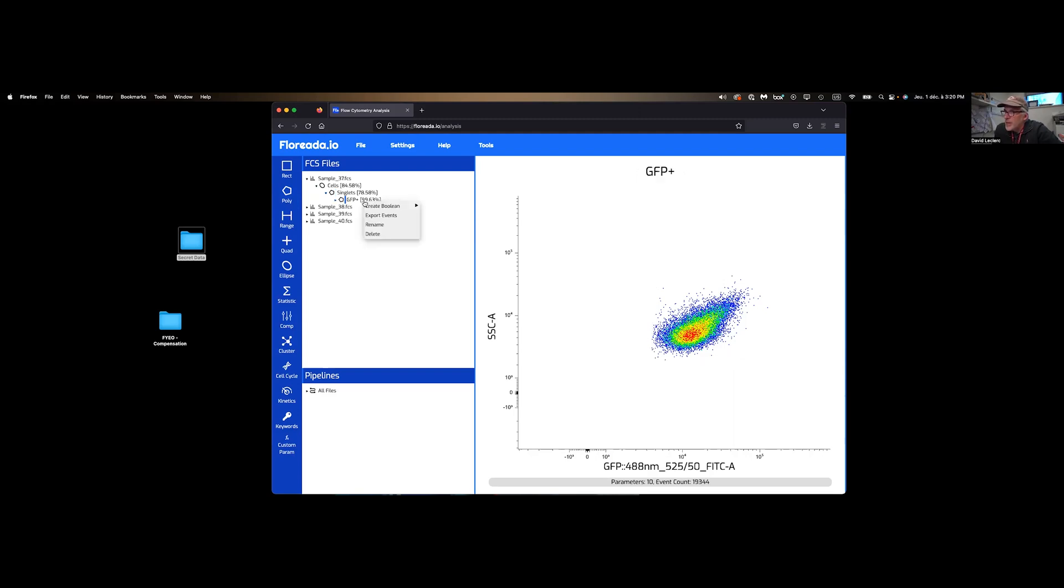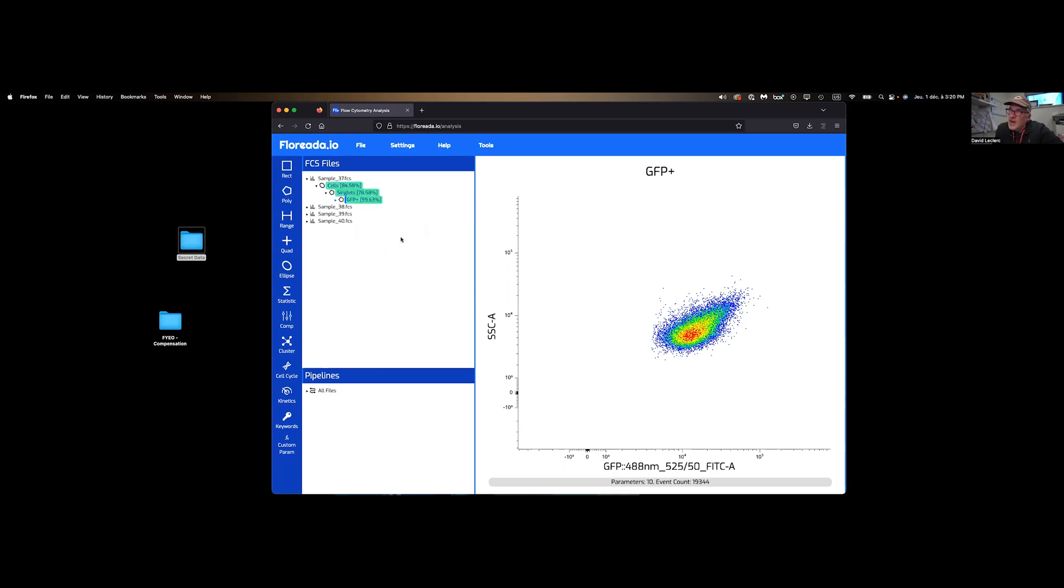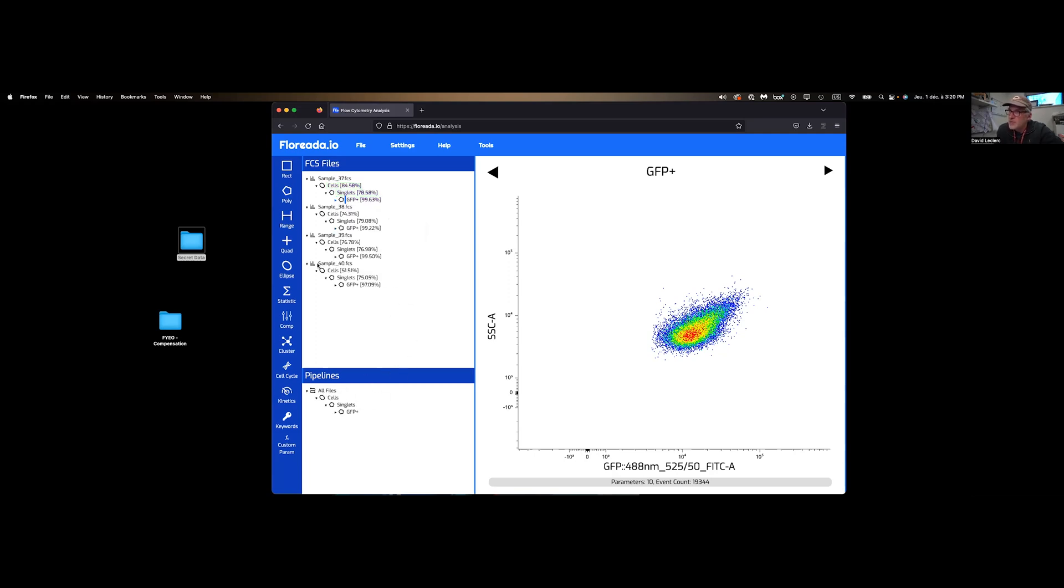By right-clicking, right-clicking is your friend on this tool. So you can rename the gates and stuff like that. At this point, we have the gating strategy for a single sample. By command selecting all these gates over here, I can drag them on either every one of my samples. Or more simply, I can go to pipelines at the bottom and clicking on all files will apply these same gates for every one of these samples.